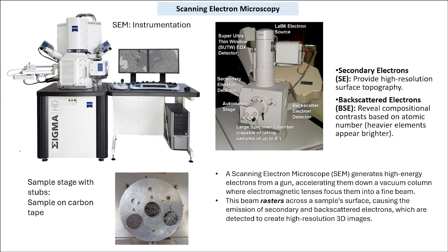Whenever you go to labs, you'll see a system like this. So this is scanning electron microscopy. Now, if you see here, there is a door handle. Okay, this is a handle. When you open this door, you'll see a sample stage. This is the kind of sample stage that is there.